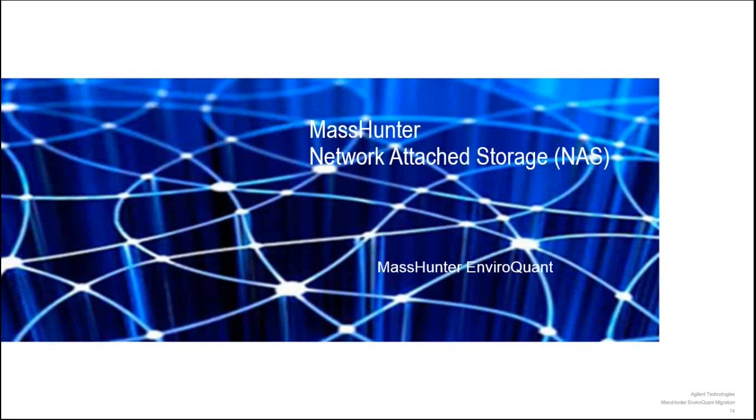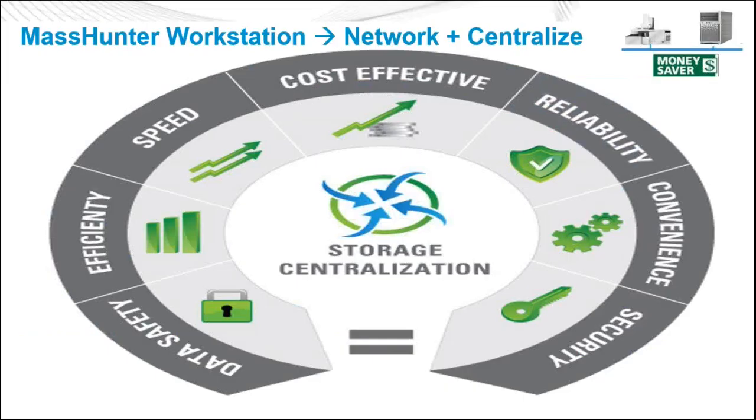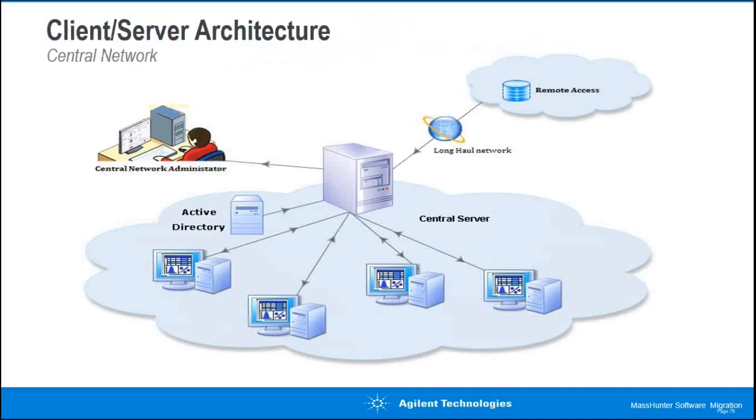All right. Last, I'm going to wind down and broaden out with networks. I don't think I need to convince anybody of the power of getting onto the network, the power of centralizing, and the cost-effective nature of that in a high-throughput lab. The client-server architecture that I'm describing here is having the PC, and I mentioned the power of the dual monitor and having the power of the PC, and I'm going to show you a configuration.